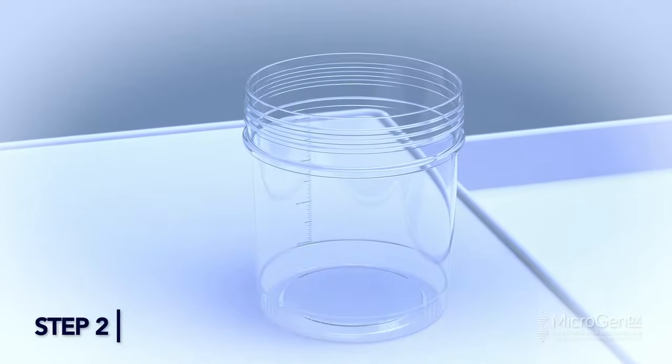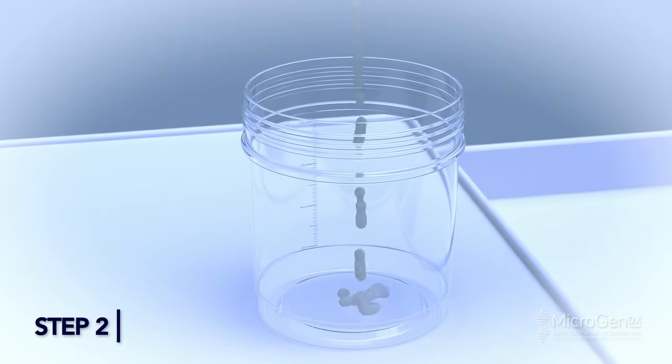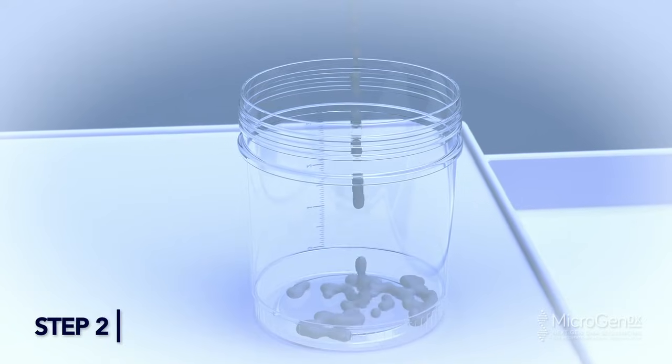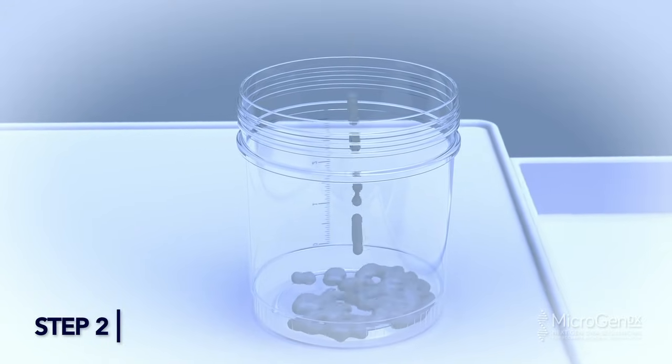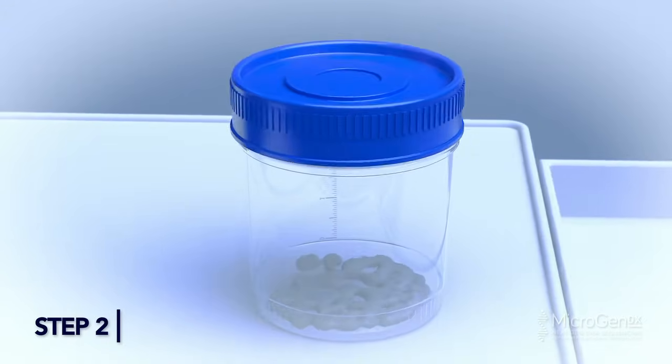Step 2: Collect semen excretion into sterile container. If enough excretion is collected, more than a pea-size amount, cap and seal the container and prepare for shipping.